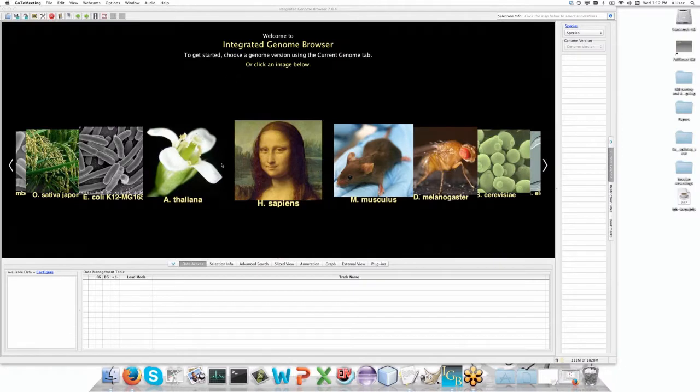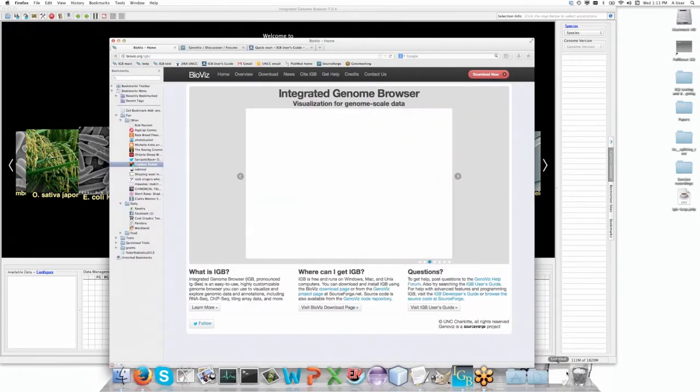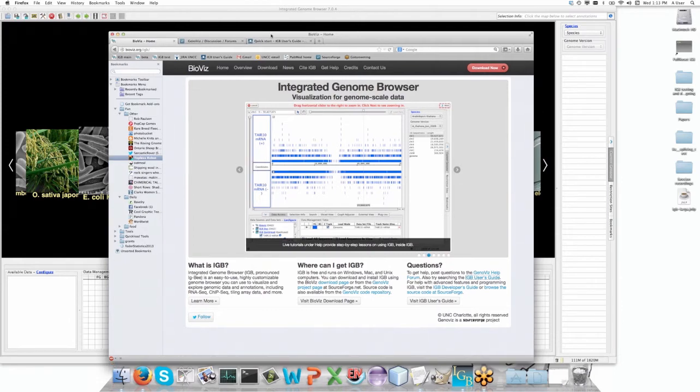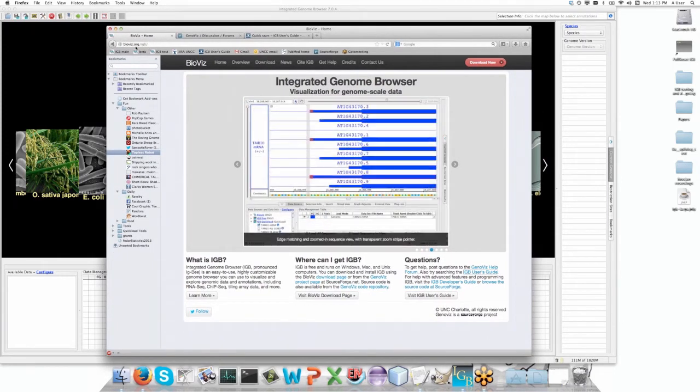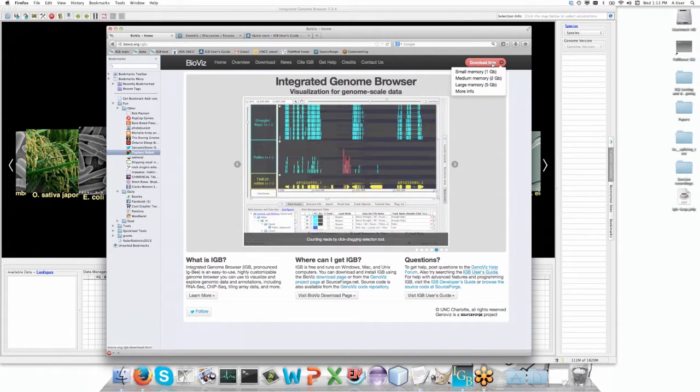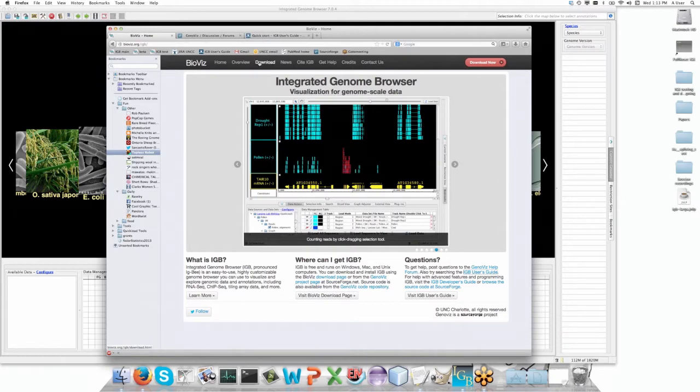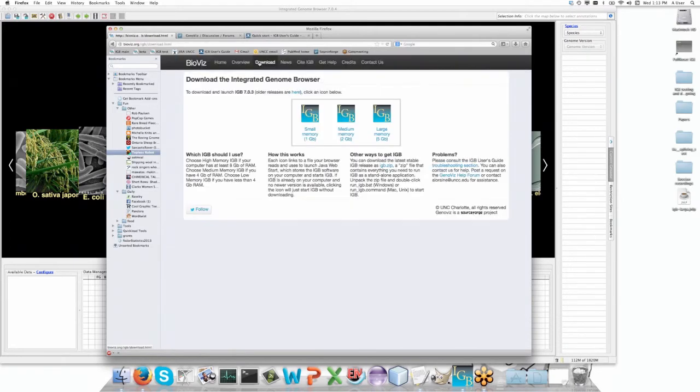Thank you for joining us. I'll introduce you to IGB. Since this is an introduction right from scratch, I want to show you the BioViz home page at BioViz.org. This is the home page for IGB where you can immediately download any of the versions or go to the download page.